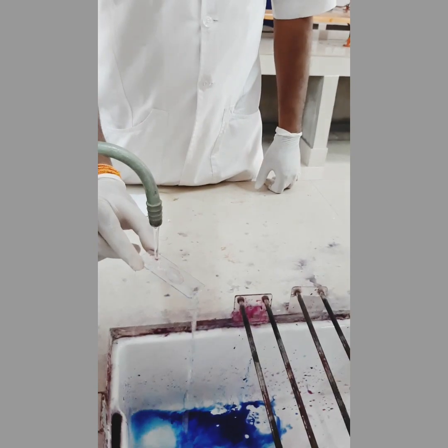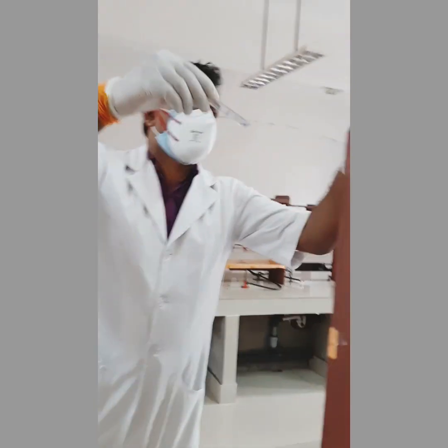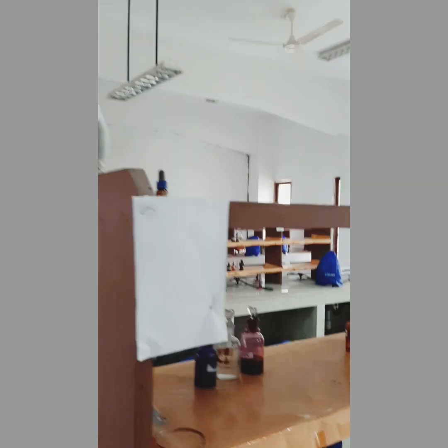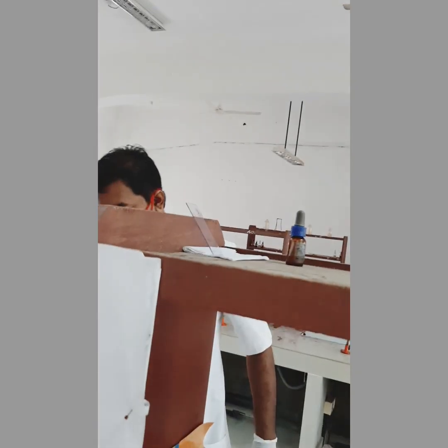Then again wash with water and keep it for drying in a slanting position.